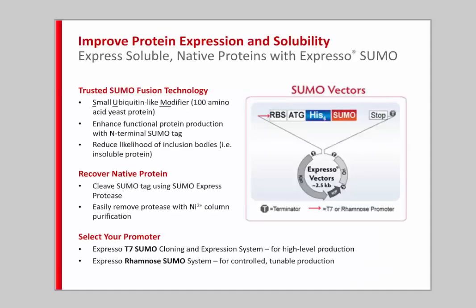That's really interesting that the 6-His tag appears to be definitely the winner there and the most popular. So the next challenge we want to talk about is related to purification and different fusion partners and tags. And we want to tackle protein expression and solubility.